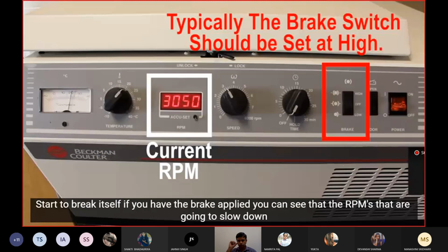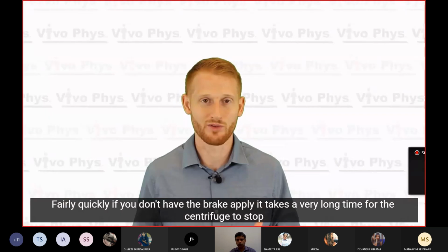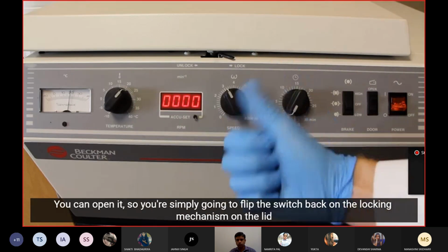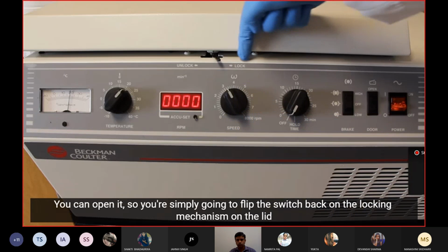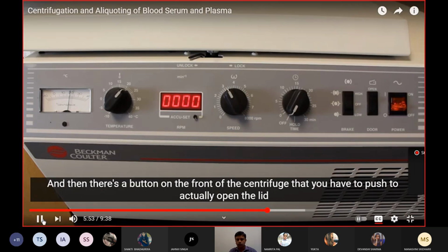If you have the brake applied, you can see that the RPMs are going to slow down fairly quickly. If you don't have the brake applied, it takes a very long time for the centrifuge to stop. All right, so once the centrifuge has stopped, you can open it. So you're simply going to flip the switch back on the locking mechanism on the lid, and then there's a button on the front of the centrifuge that you press.